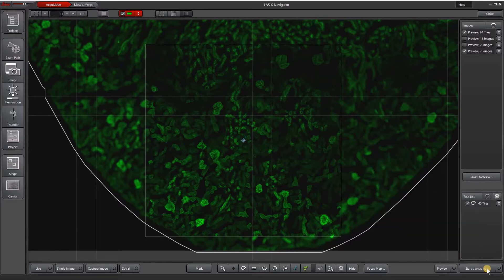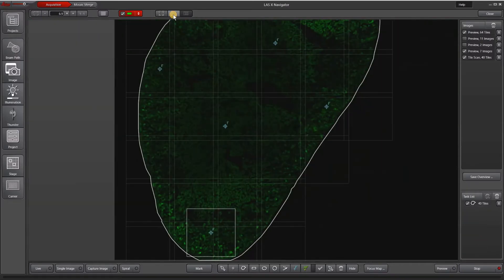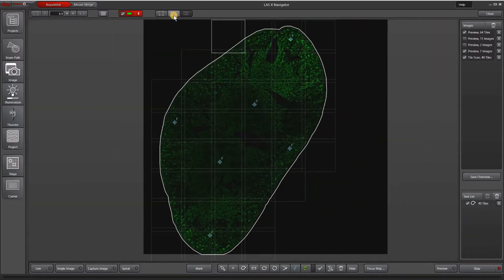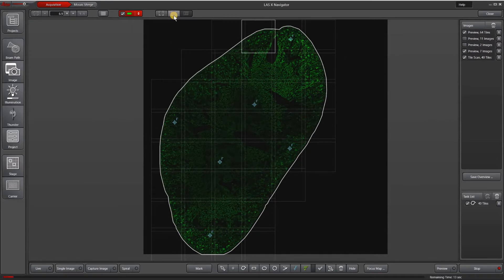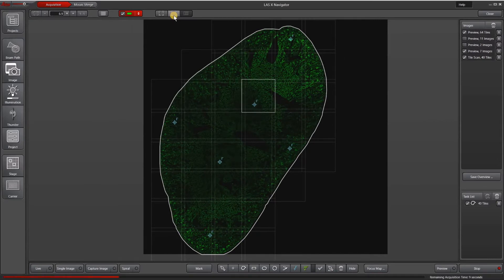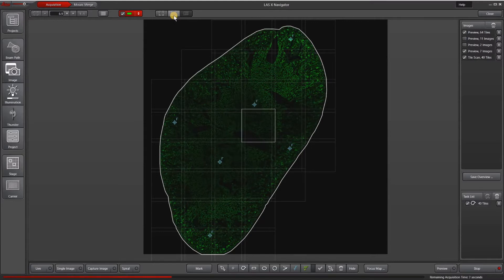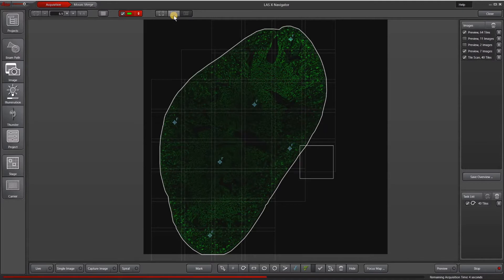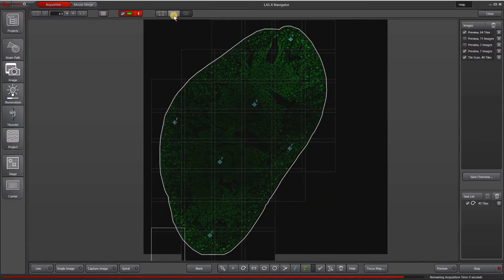Now it's just going to do the tile scan using my focus map points as reference points for how to focus around in each individual tile.